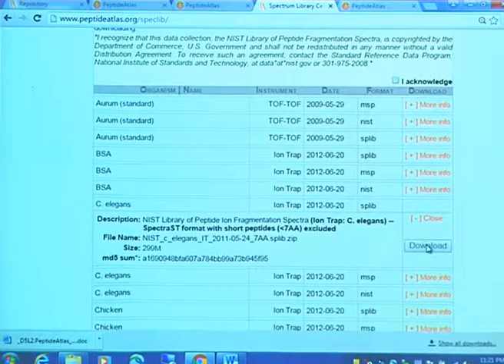But yeah, basically this is the download link, and this will download all three libraries, the splib and the two indices. And that's what, as Luis pointed out, Petunia is doing behind the scenes.